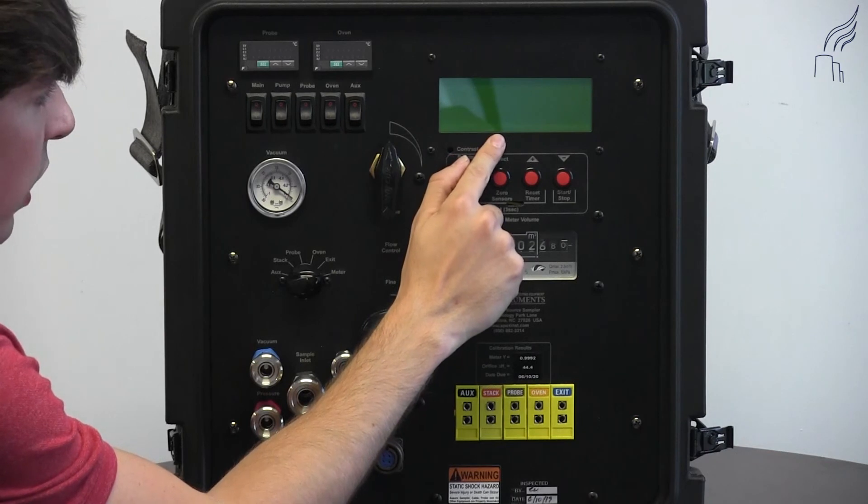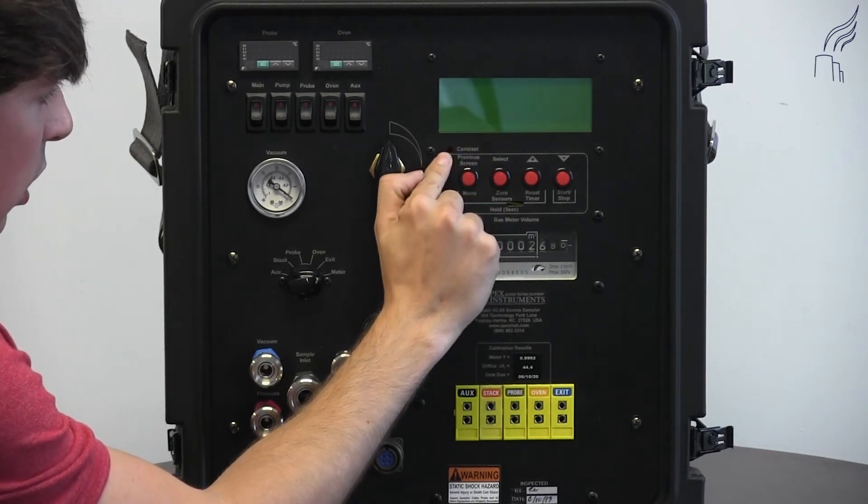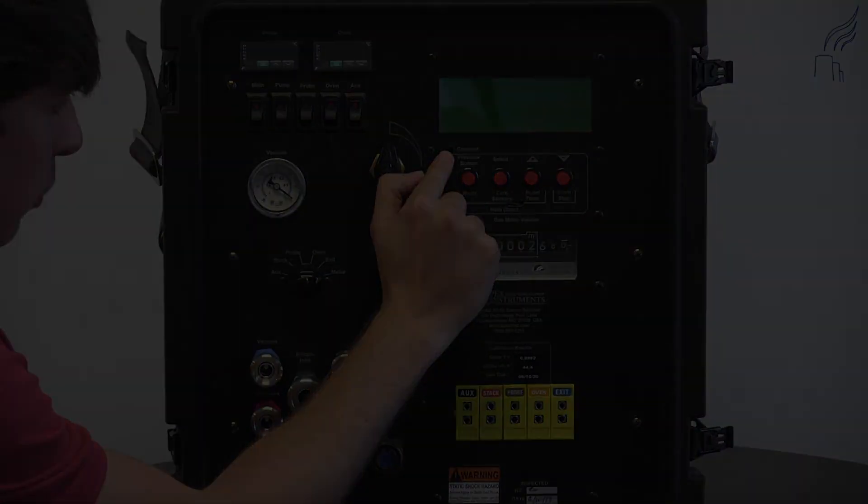And here at the top right, we have our LCD display and our contrast adjustment that adjusts the contrast of the display.